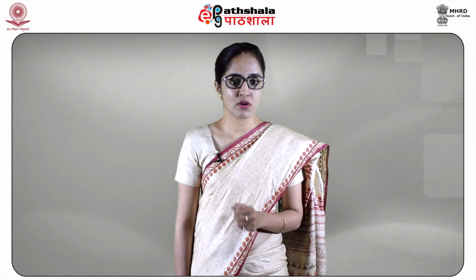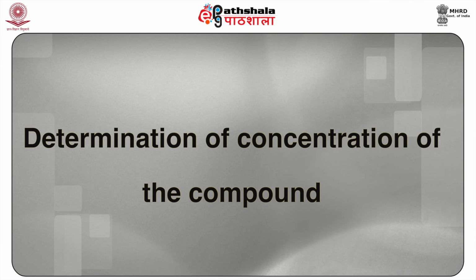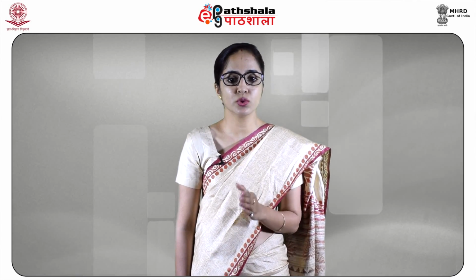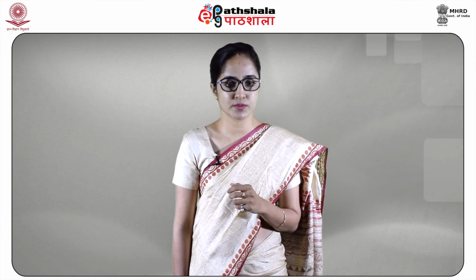Now students, another aspect of UV visible spectroscopic applications is the quantitative analysis of various compounds. The first in this would be determination of the concentration of the compound. UV absorption spectroscopy can be used for the quantitative determination of compounds which absorb UV radiation. Now, this determination is based on Beer's law, which relates the absorbance of the substance at a particular wavelength to the concentration C as follows.